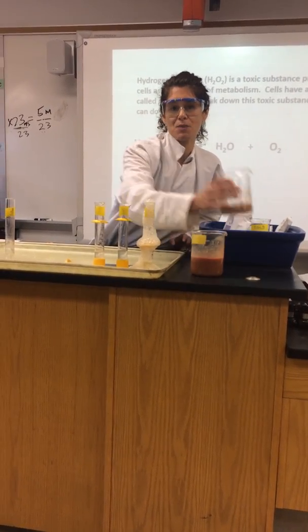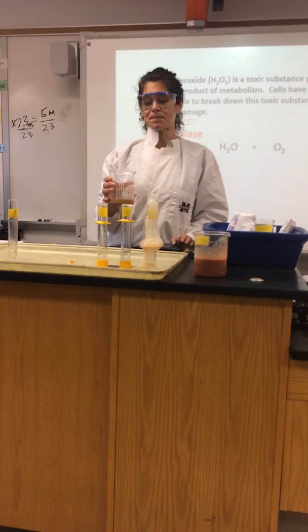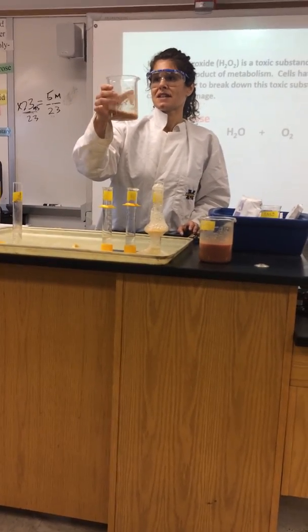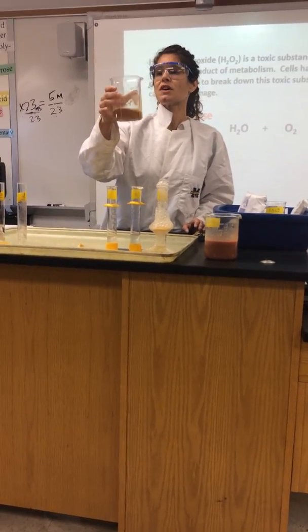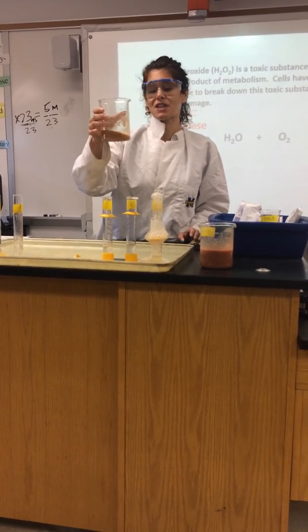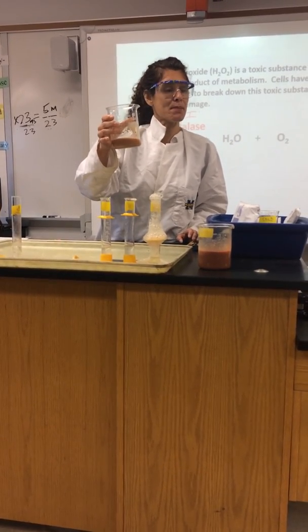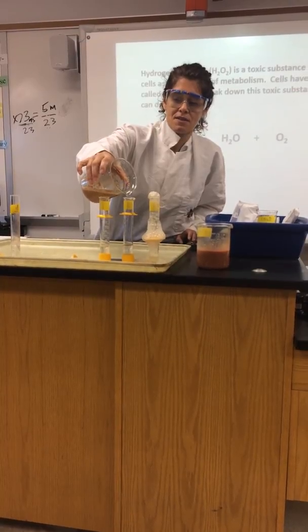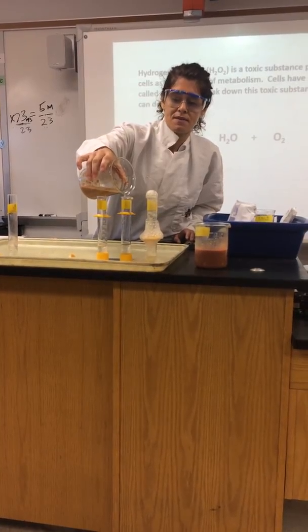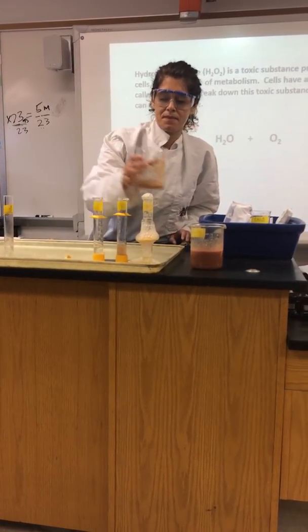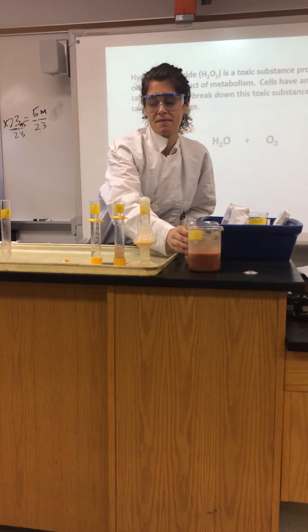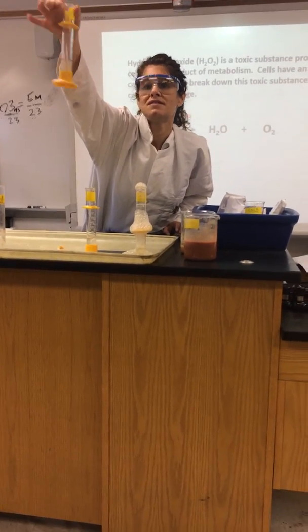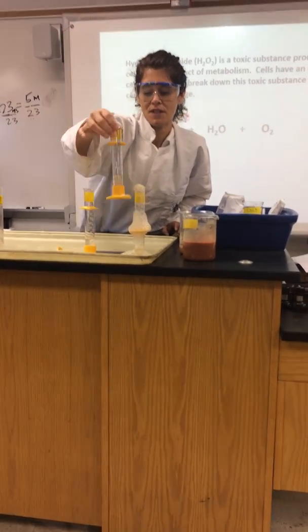The B graduated cylinder is actually some boiled liver. Remember what you learned yesterday about what happens at extremely high temperatures to enzymes. Do we have any bubbling there? No, we do not.